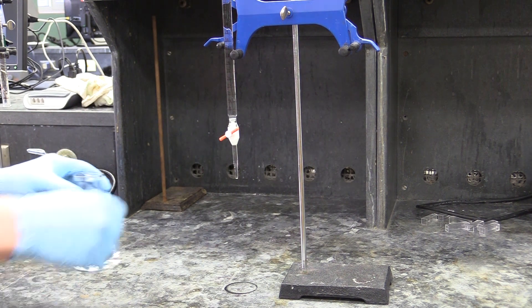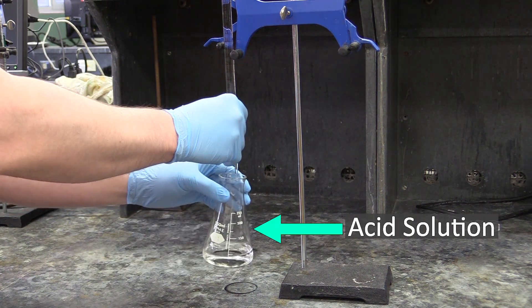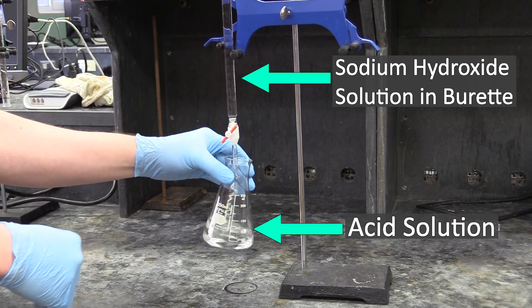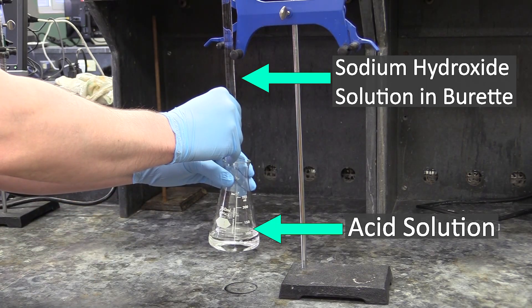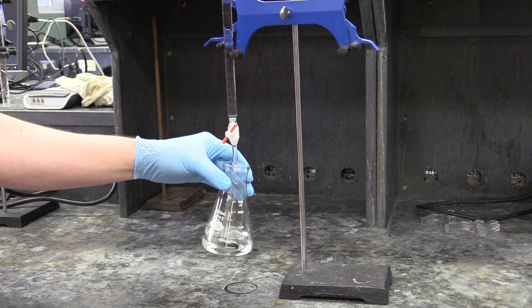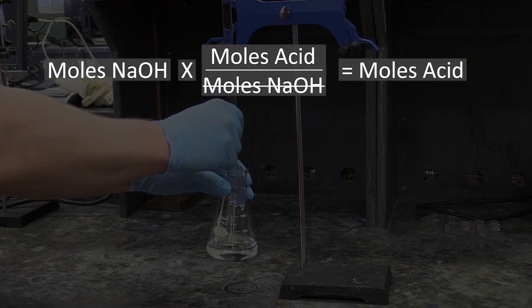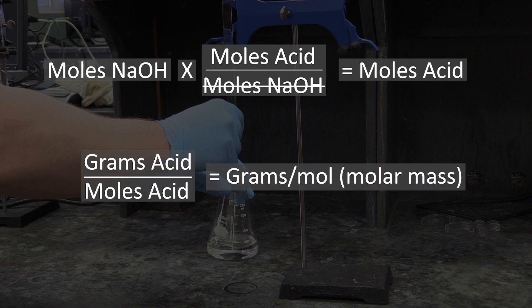In this technique, you will start out with a solution of acid in an Erlenmeyer flask. You will then add sodium hydroxide solution to the acid by burette, and you will keep adding it until all of the acid has reacted with the sodium hydroxide. In your calculations, you will take the moles of sodium hydroxide you added, use the reaction stoichiometry to convert to moles acid, then take the grams of acid that were present and divide by moles to get the acid's molar mass.